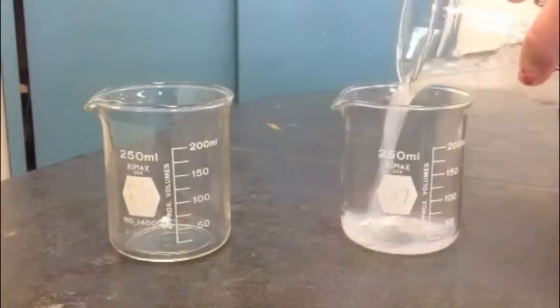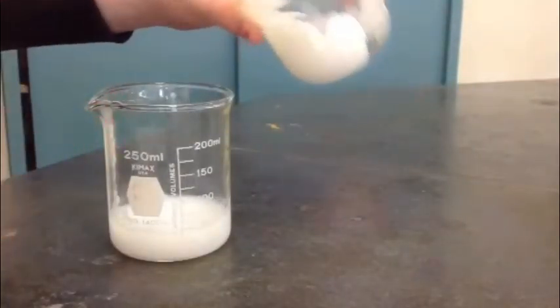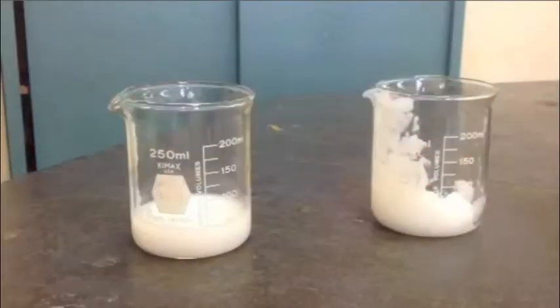Now that we have our metal hydroxide, we can explore its amphoteric properties. To do this, we must split our zinc hydroxide precipitate into two containers. To the first beaker, which now contains 1/2 of the zinc hydroxide precipitate, we will continue to add hydroxide. To the second beaker, which contains the other half of the zinc hydroxide precipitate, we will add hydrochloric acid. First, let's see what happens when we react zinc hydroxide with sodium hydroxide.